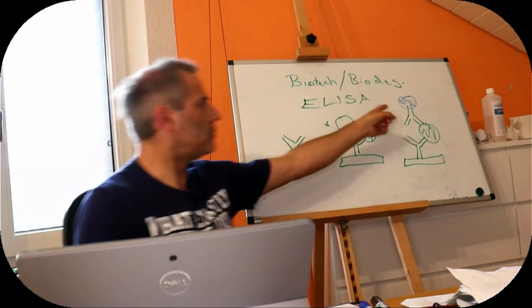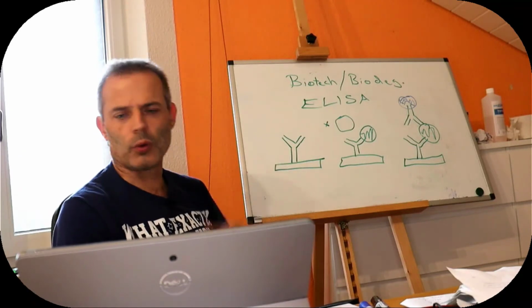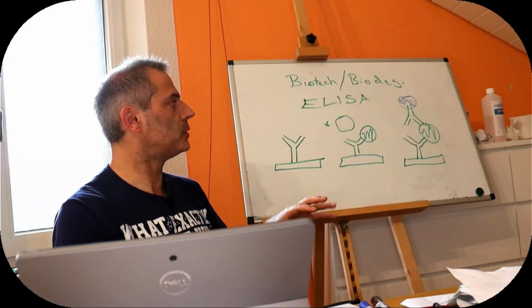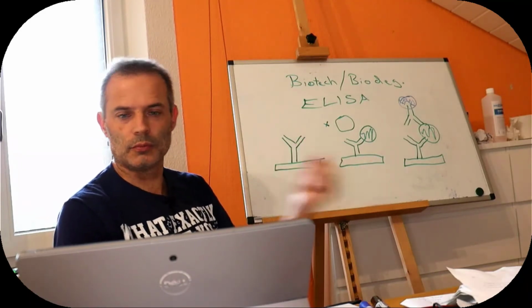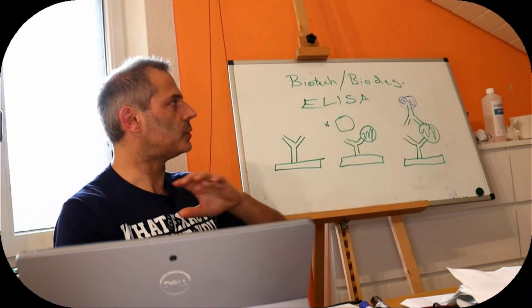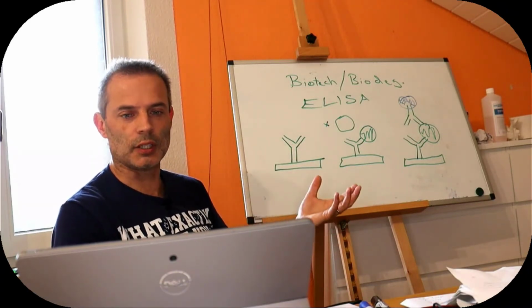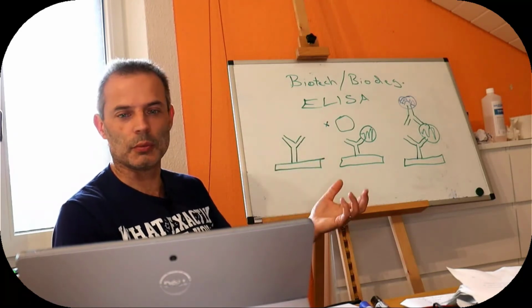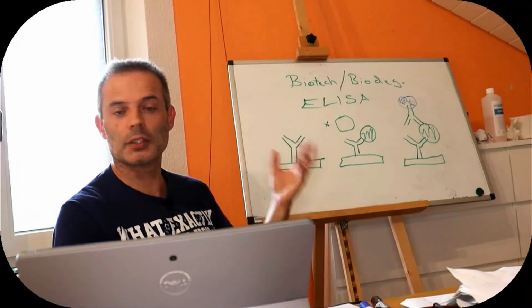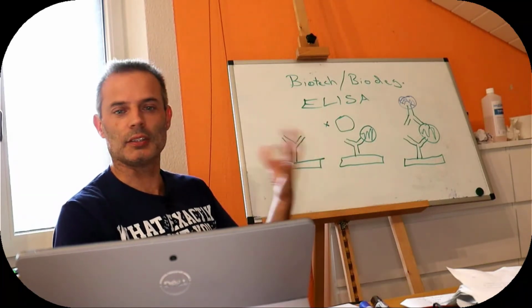Typically the result will make a fluorescent dye, because fluorescent dyes are relatively easy to detect, or a coloured dye. But fluorescent dyes are even better because they're easy to detect. You can detect them in extremely low amounts, and that's because of the physics of fluorescence. We put in a light that is blue, for example, and we get green light out, so we can make everything black and no green light comes in, and then it is comparatively easy to measure the green light because we have no disturbance. We're not subtracting anything from anything else. As you will know from physics, if we subtract numbers from each other, we get error, whereas if we don't have to do that, it's a lot easier.